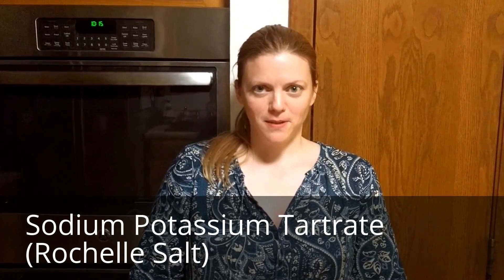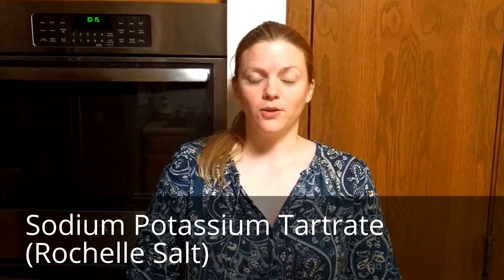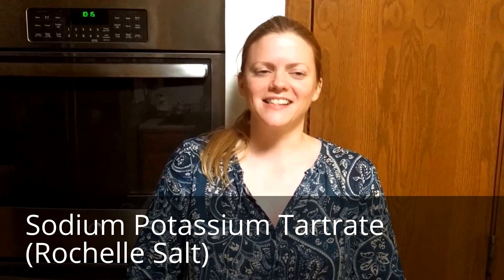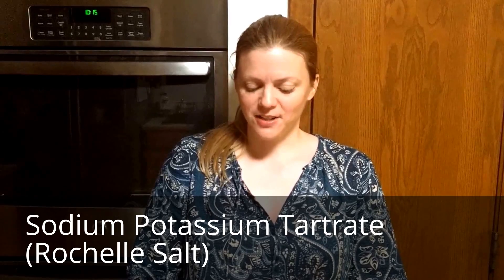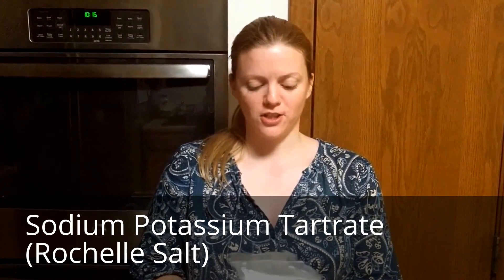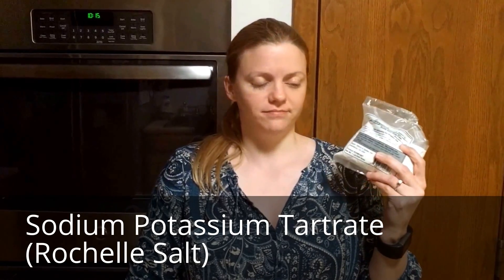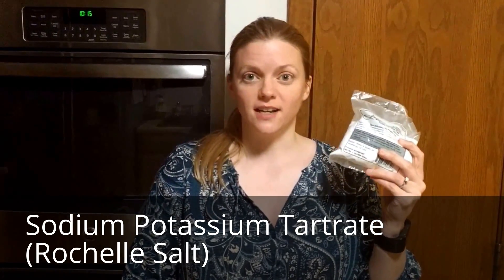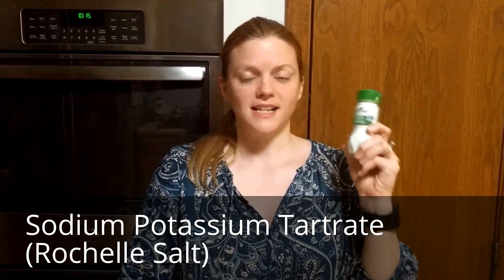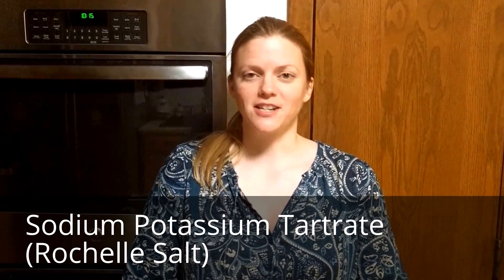Today we're going to do a little experiment where we're going to make a natural piezoelectric material called sodium potassium tartrate, also known as Rochelle salt. It's actually pretty easy to make and uses two fairly common ingredients. The first is sodium carbonate, or soda ash, which is found at art supply stores where it's used as a dye fixer, and cream of tartar, or potassium bitartrate, which is found in the spice section of your grocery store.